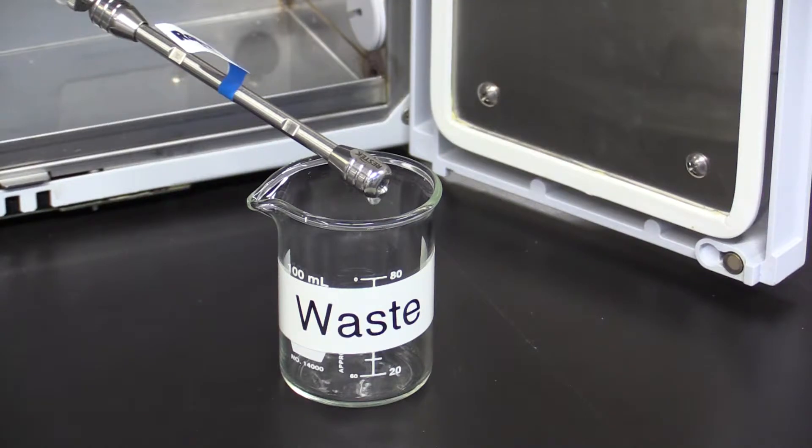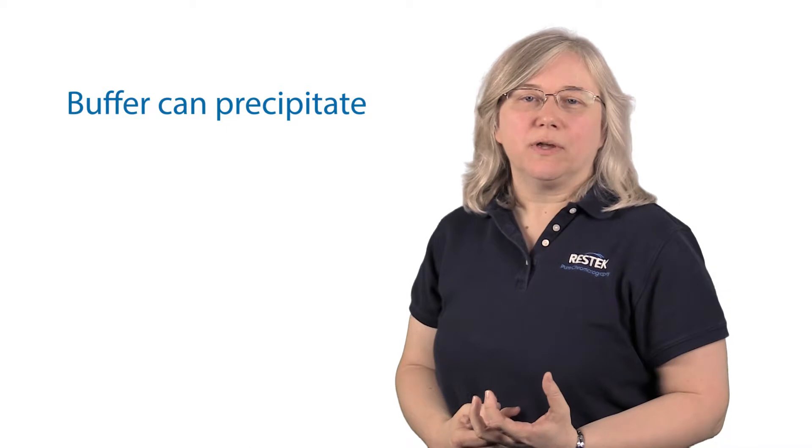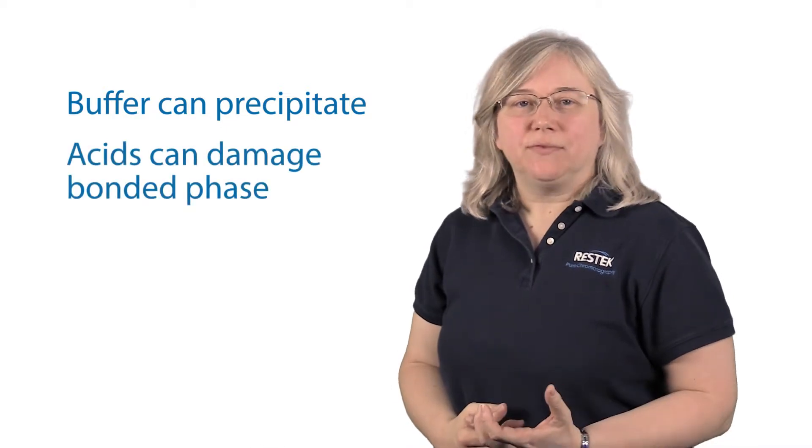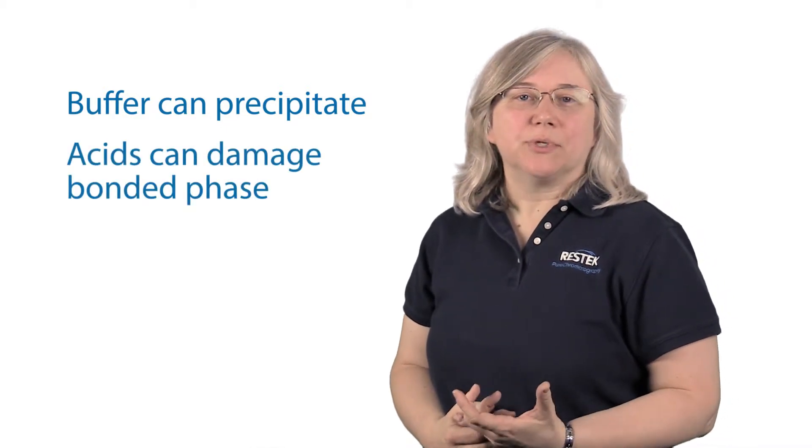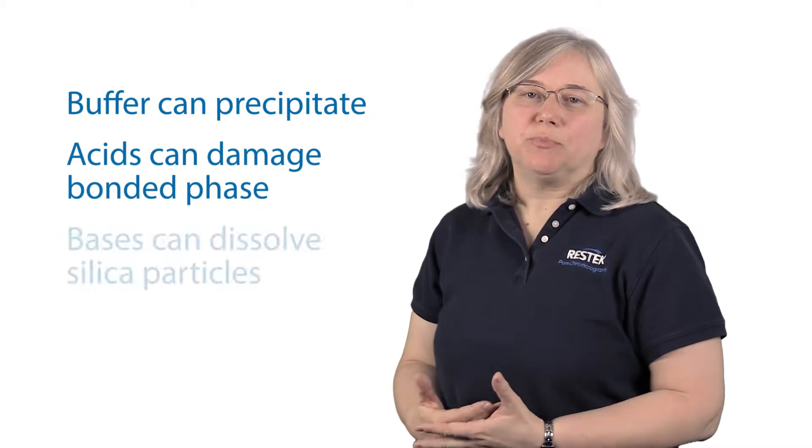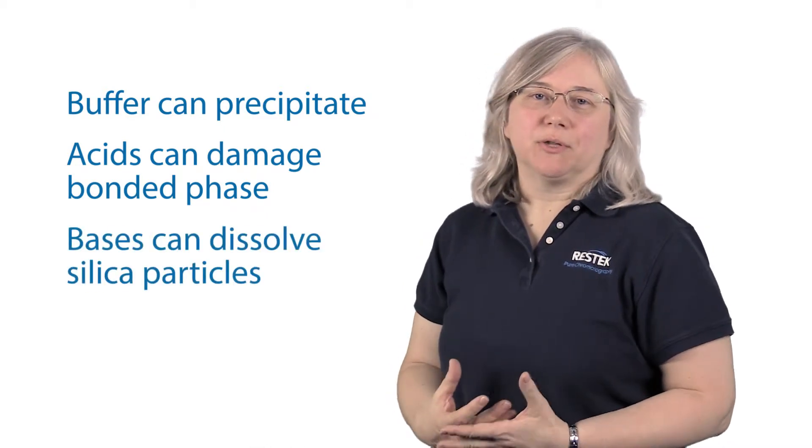But when it comes time to give a column a break, it's important to store it properly so it's ready to go the next time you need it. The first thing to do is flush out any buffers, acids or bases that are part of your mobile phase system. This is important because any particulates from the buffer could precipitate and clog the column. Too much acid left in the column could hydrolyze the ligand from the silica surface and too much base could start to dissolve the silica particle itself.